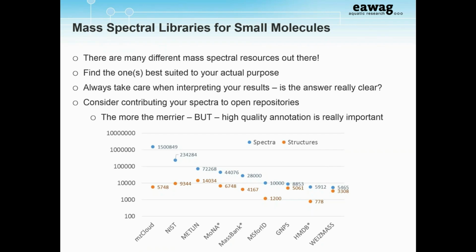That would really depend on your compounds and your analysis. Can you give an example of what you're expecting? I was just about to say, from my experience, we run environmental samples and we don't derivatize at all. Okay, so we would have nothing derivatized, but the reason I mentioned it is that in metabolomics, I know it is very common. I do not deal with derivatized spectra very much at all. The only very little experience I have is within the Solutions project, where we're playing around with derivatizing LC-MS/MS spectra, but I'm afraid that's one I can't answer. Yeah, no, that's all right. I think there's plenty of literature out there that should help out.